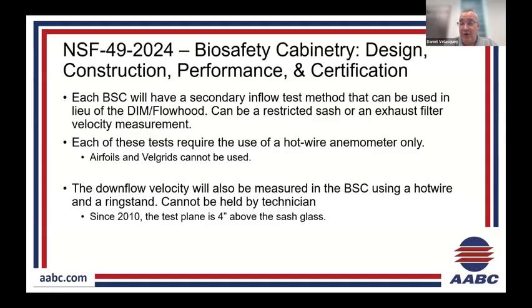The only device that the manufacturers will recommend or require is a hot wire. You can't use an airfoil. You can't use a Velgrid for these tests. You have to use a hot wire, and you have to have it on a stand. If you've seen a certifier test the downflow way back when, they used to do it right at the plane of the sash, the bottom of the sash. You just hold your probe and take the readings.